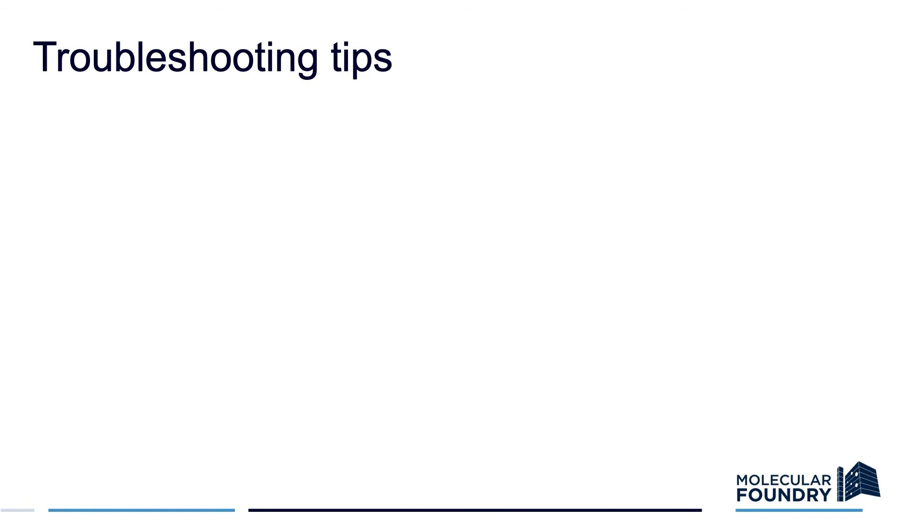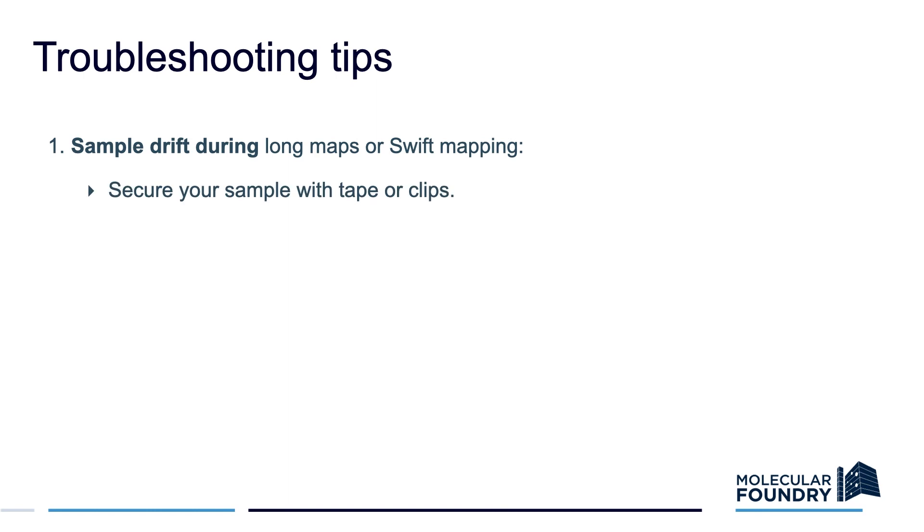Here are some troubleshooting tips. Common problems include maps shifting over time. You want to make sure that your sample is fixed pretty firmly to the stage. There are clips that you can use to fix your samples to the stage, but most people tend to use double-sided tape to make sure their samples don't move during a really long map.